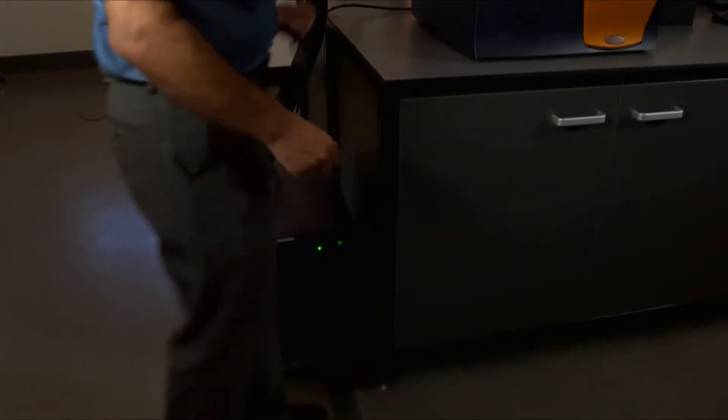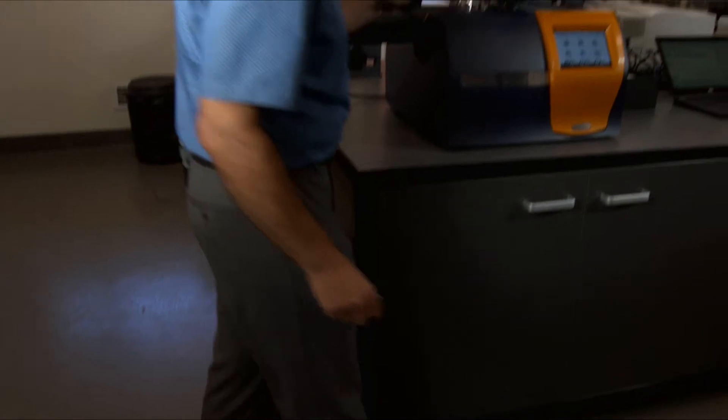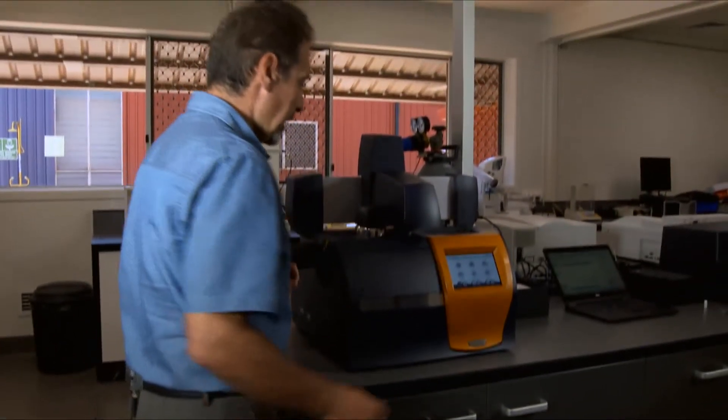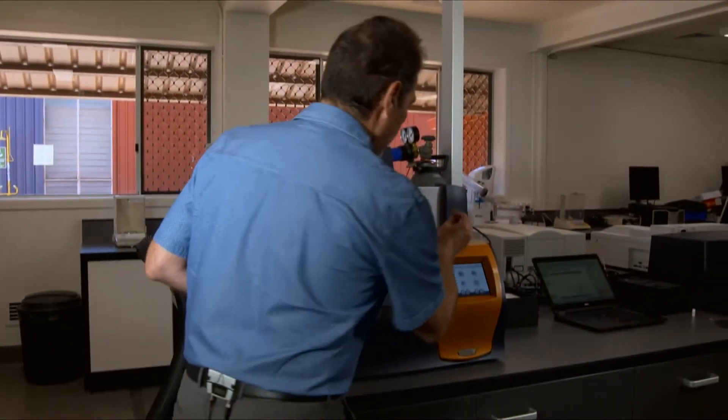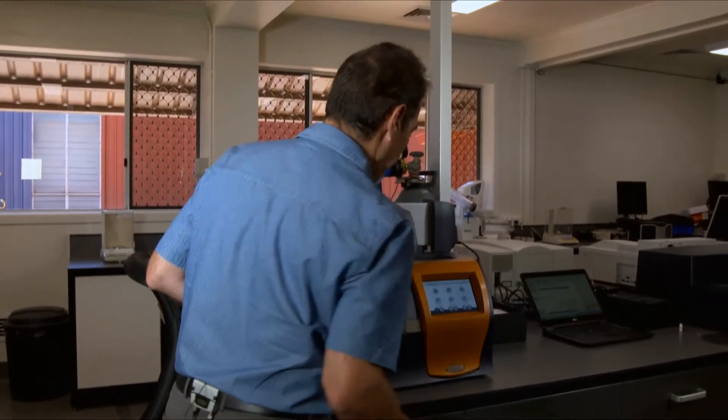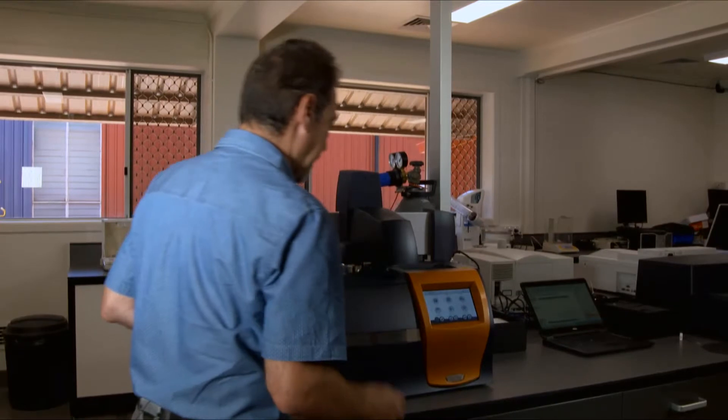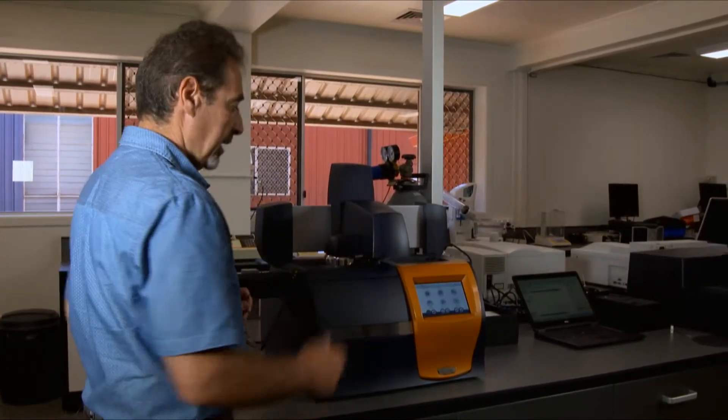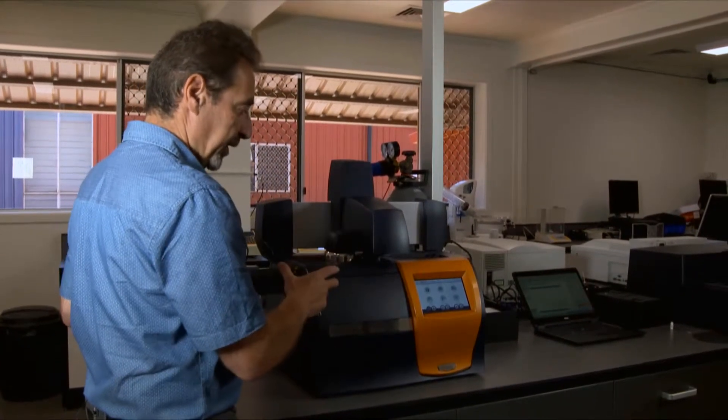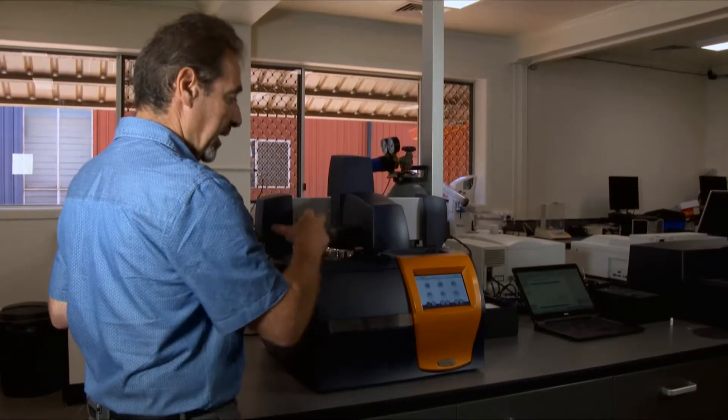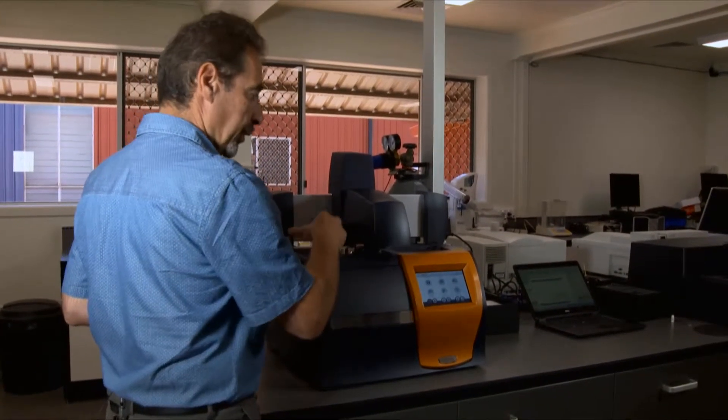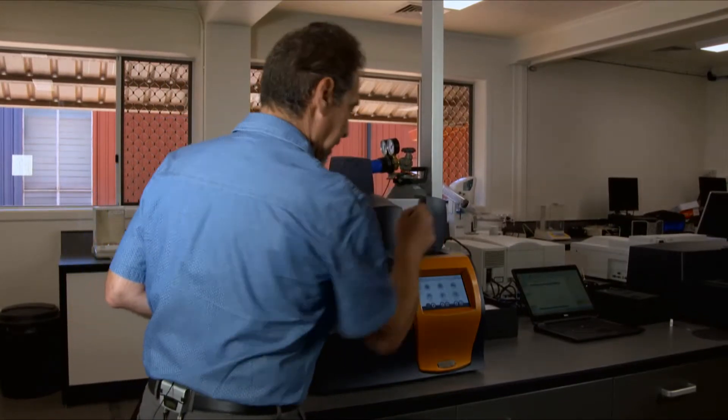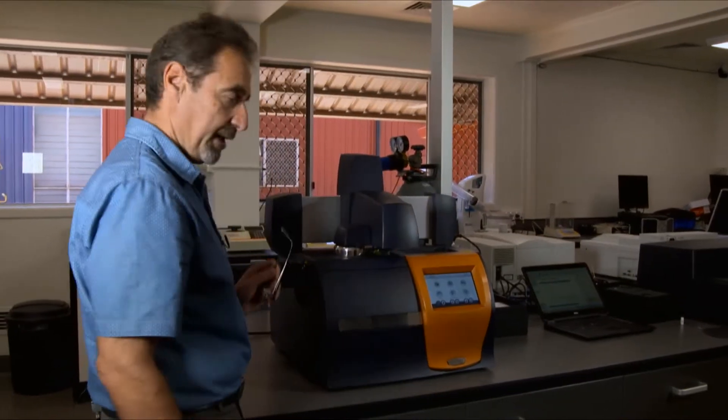It's got an automatic arm which will pick up the sample and reference, load into the cell, run the test, then unload sample and reference back into the tray.